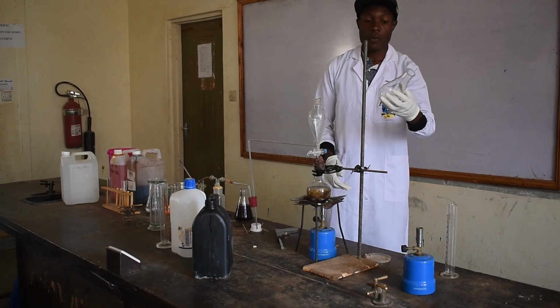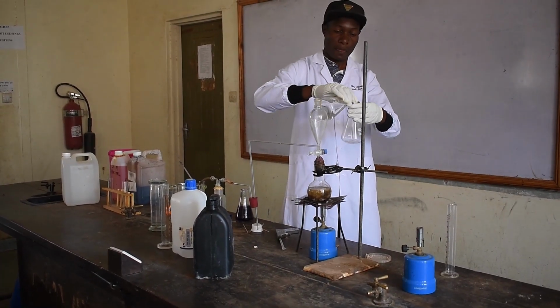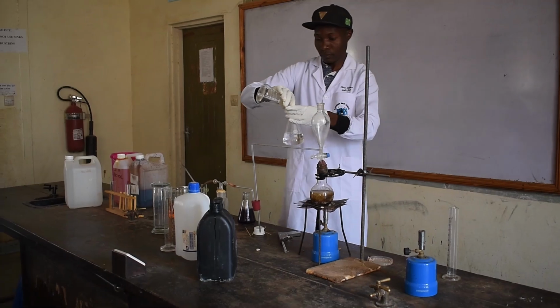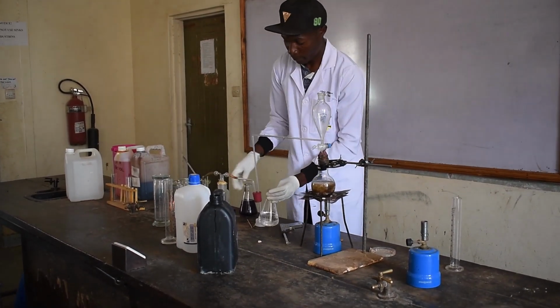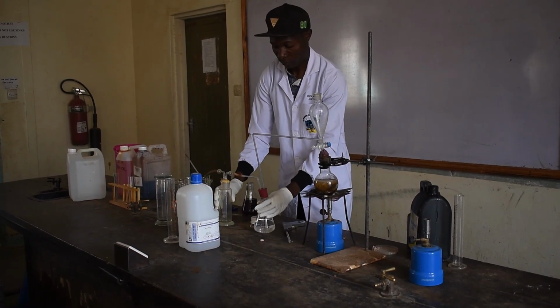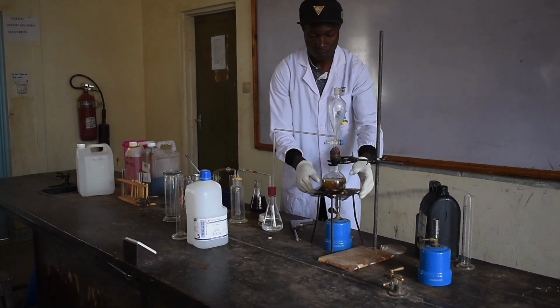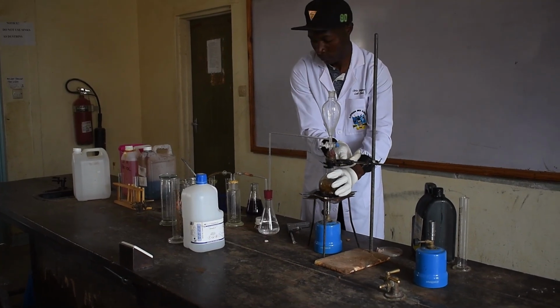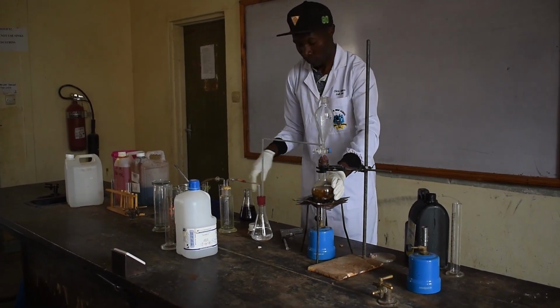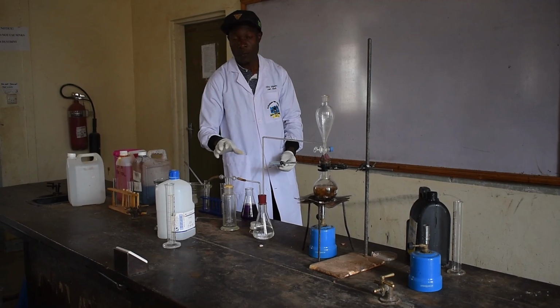In the conical flask, I'm going to add sodium hydroxide. This is sodium hydroxide. Now, the gas jar at the end will just help us to compress the gas for easy collection.